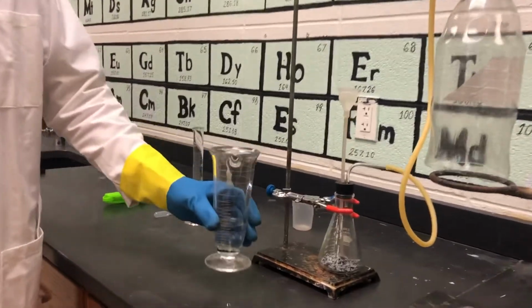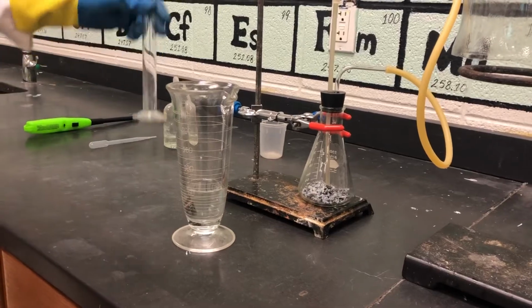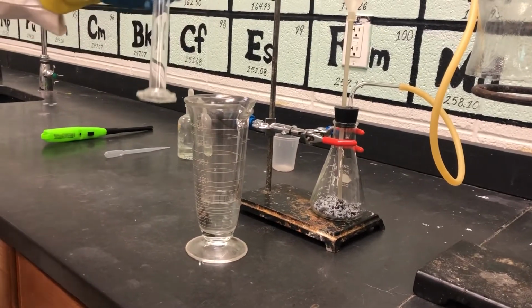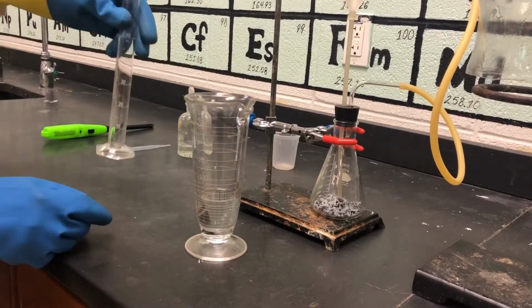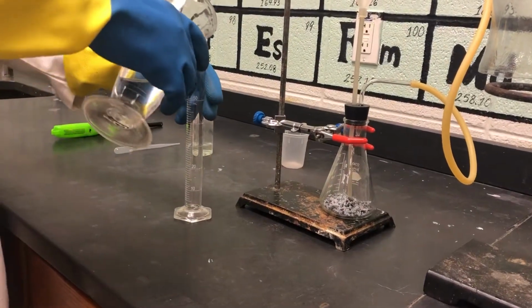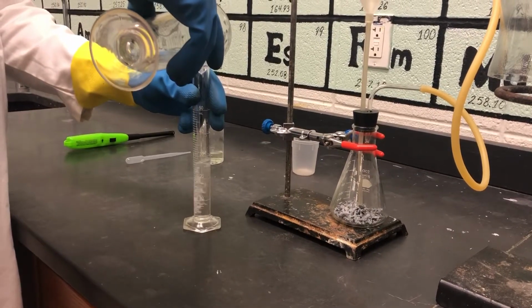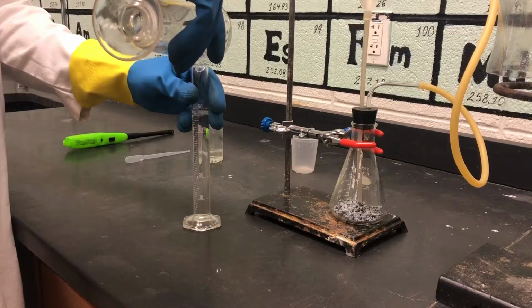This is an older graduated cylinder. This one is a new one, and supposedly I've got it set right at 50 milliliters. Thought it might be interesting to check it out, see how close our measurements were.